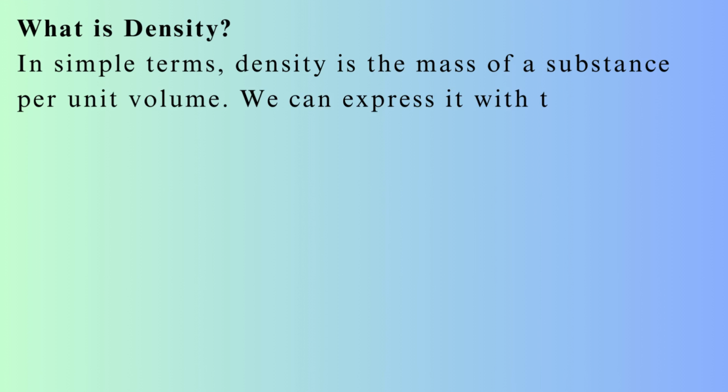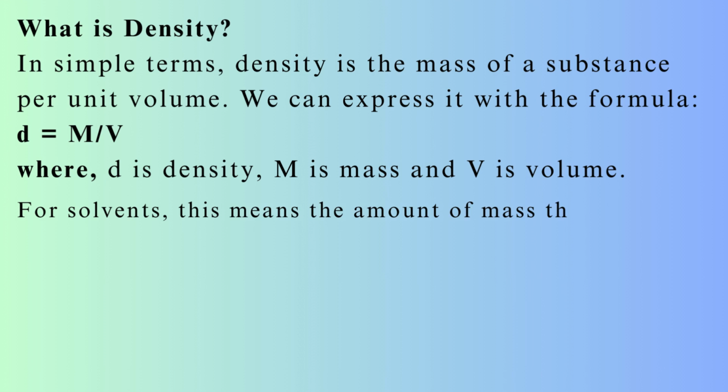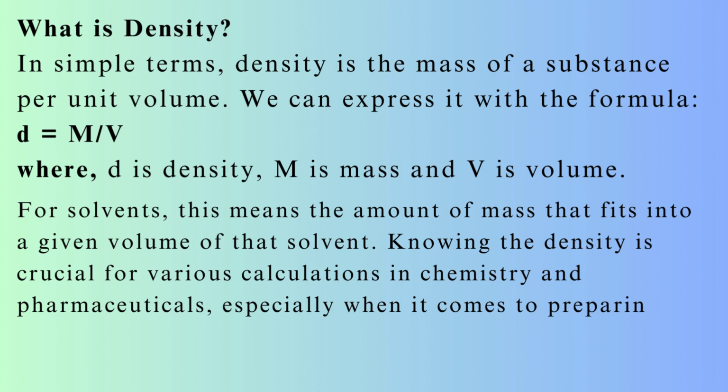We can express it with the formula D equals m/v, where D is density, m is mass, v is volume. For solvents, this means the amount of mass that fits into a given volume of that solvent. Knowing the density is crucial for various calculations in chemistry and pharmaceuticals, especially when it comes to preparing solutions.